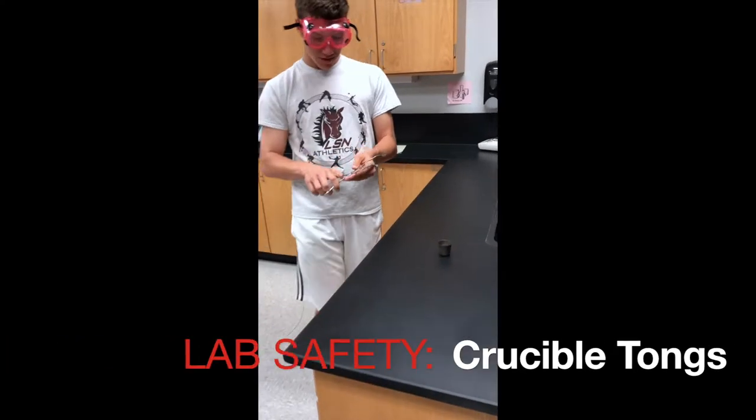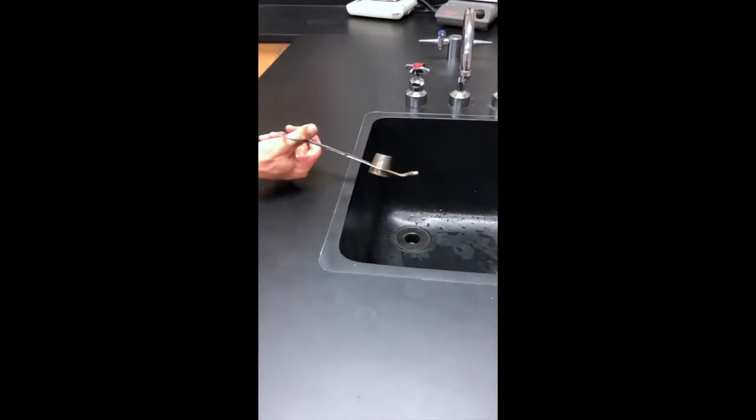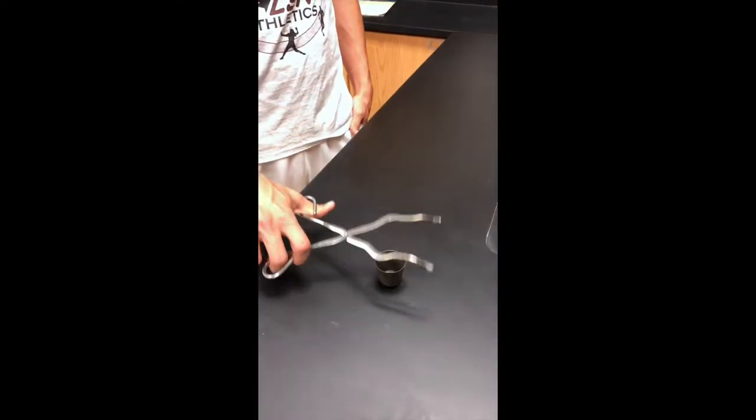The tongs, you're supposed to use them with this groove. You use them to pour out the liquids inside the crucible. You also use the tongs so you do not burn your hands.